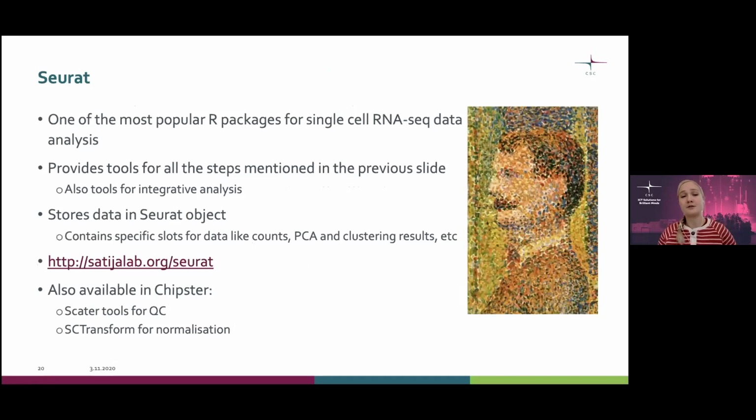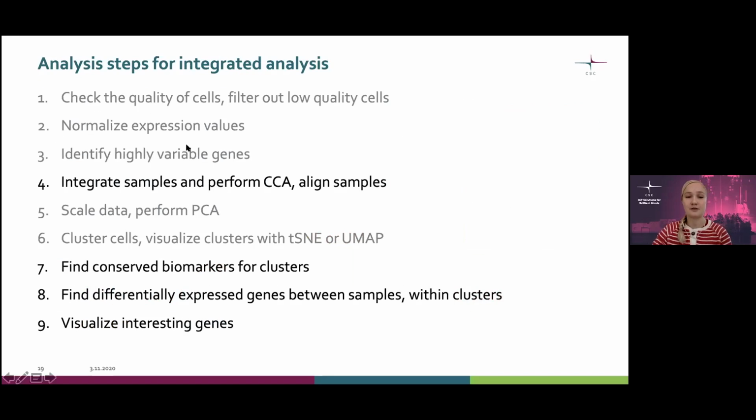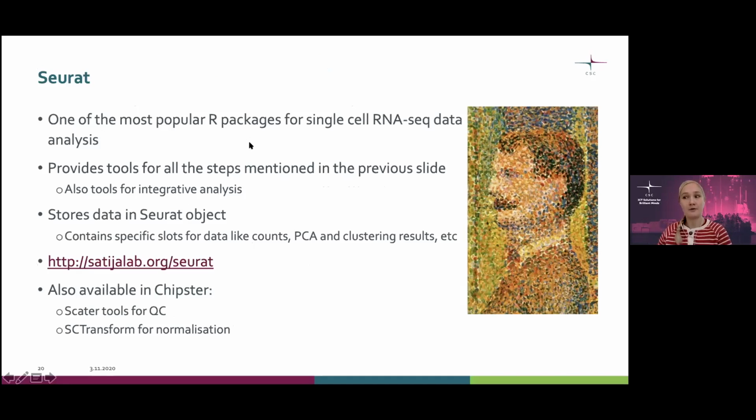Important thing to mention. So in the exercises, we are using these Chipster tools, which pretty much follow these steps mentioned here. However, we haven't developed the tools within. So we have developed Chipster, and the tools within Chipster are originally from this Seurat R package, which is one of the most popular R packages used nowadays for single-cell RNA-seq data analysis.